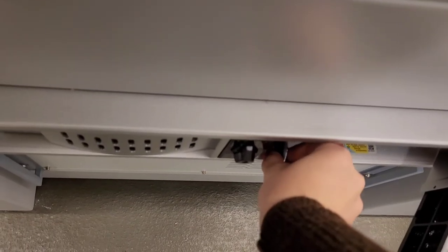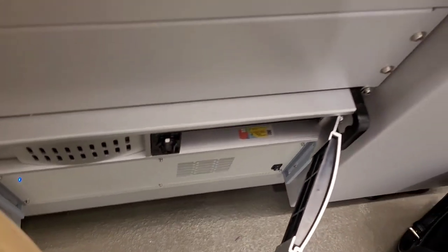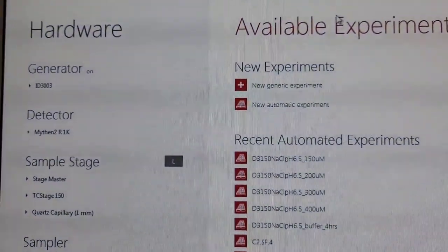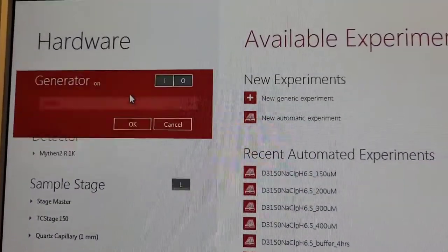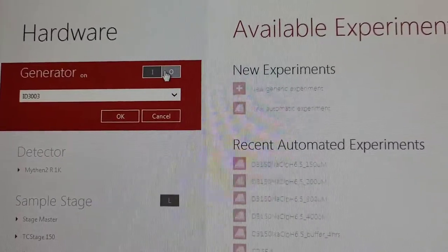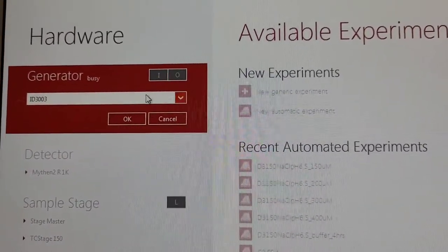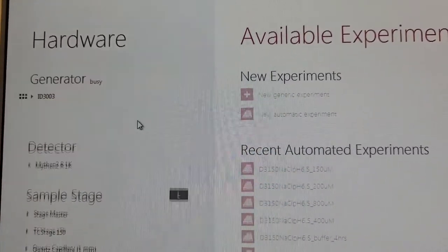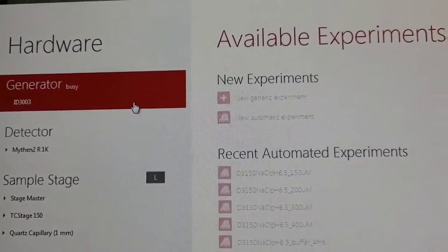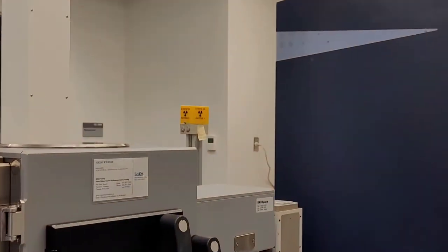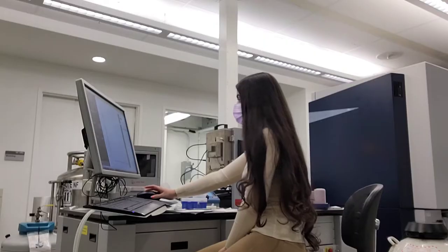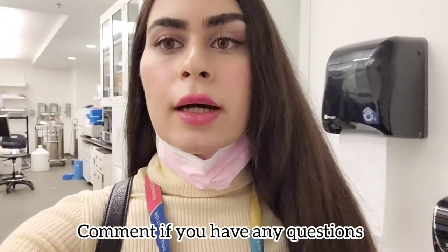After you're done, you want to turn off the X-ray generator and you will see the light has gone off. Thank you so much for watching the video. I will make a new video on how to analyze the data and how to interpret it. Thank you and bye.